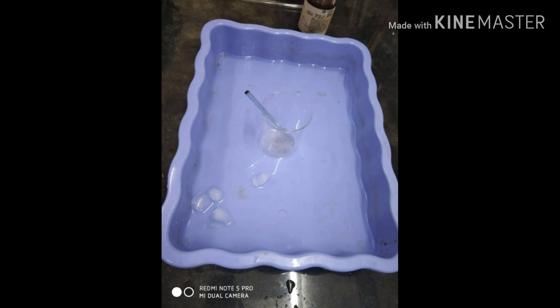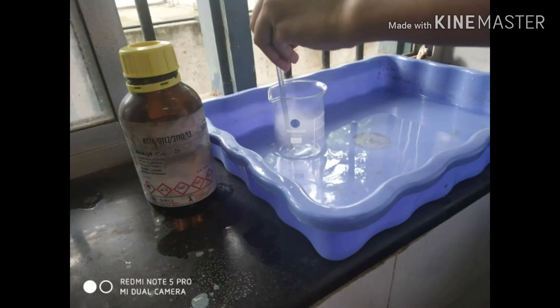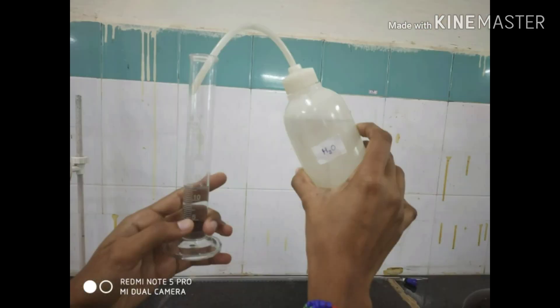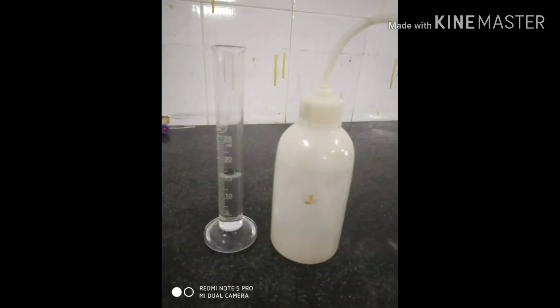The mixture is kept in an ice bath for 2 to 3 minutes. After 3 minutes, we are going to add 2 ml of acetyl chloride dropwise with continuous stirring, then add 15 ml of distilled water.